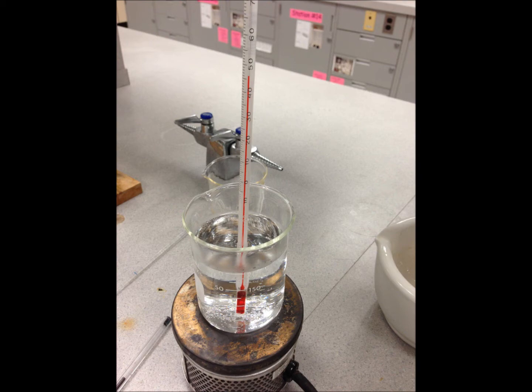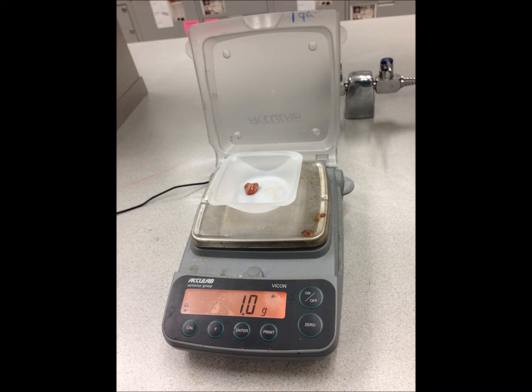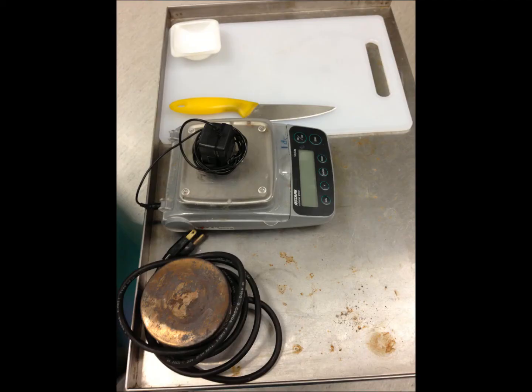The materials that we used during this lab were 1 hot plate, 3 test tubes, 3 beakers, 4 cylinders, a stirring rod, goggles, aprons, knife, cutting board, crushed ice, thermometers, beaker tongs, crushed liver, 10 milliliters of 3% H2O2.